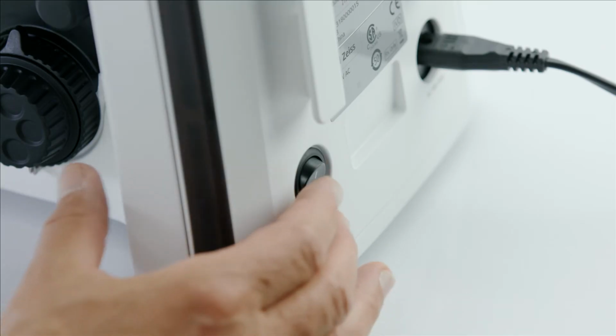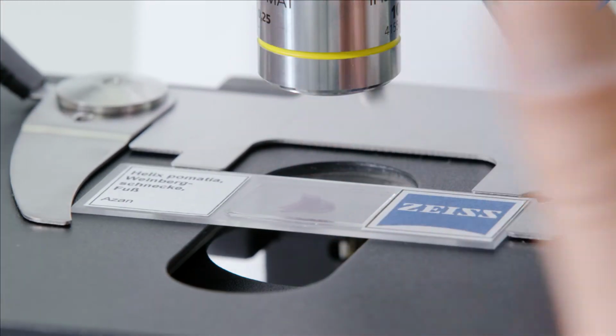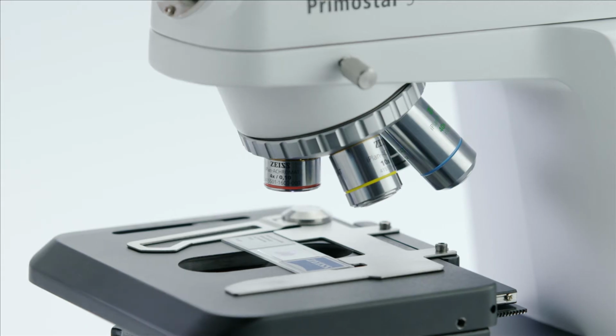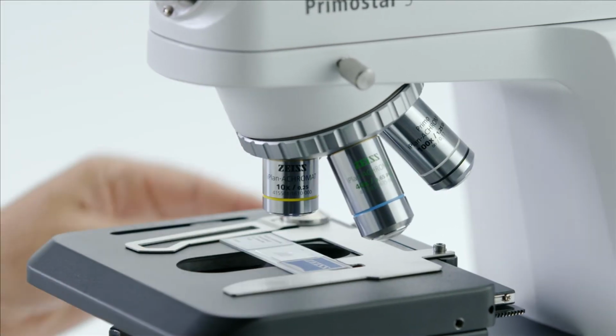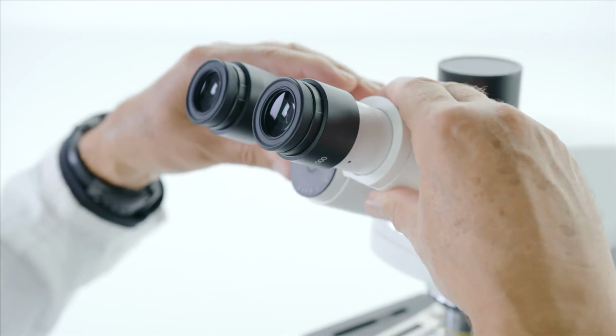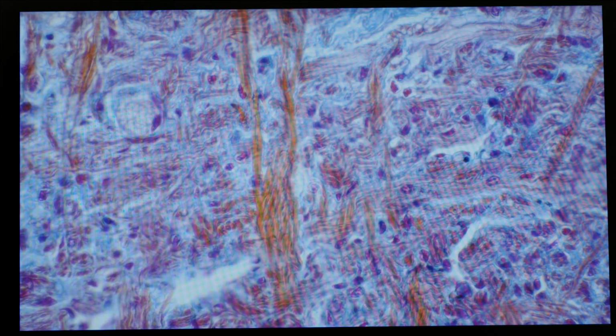Switch on your Primostar 3. Place your sample on the stage and fix it with the sample holders. Choose the required magnification by turning the objective turret. Adjust your eye distance and height with the eyepieces so that one overlaid image appears.